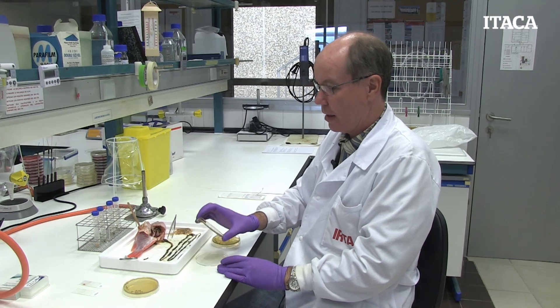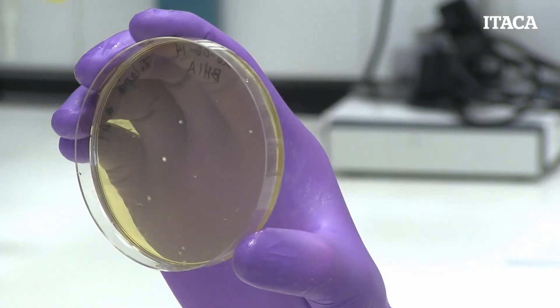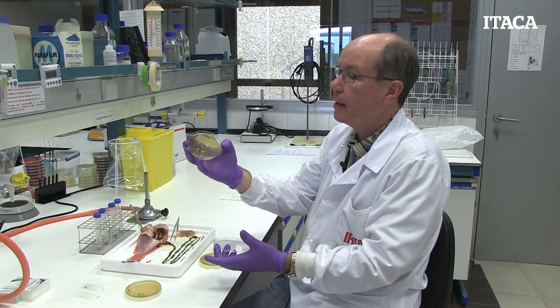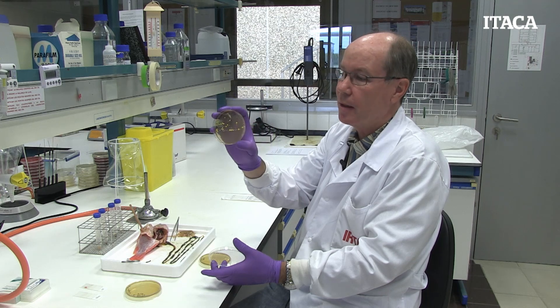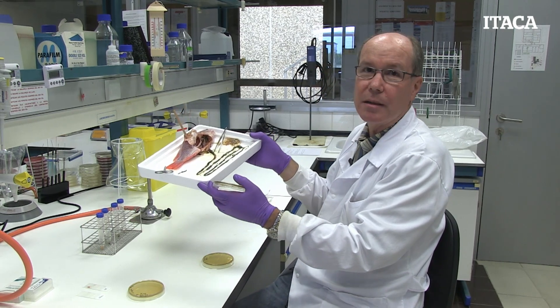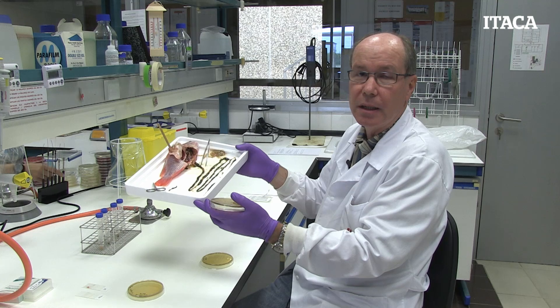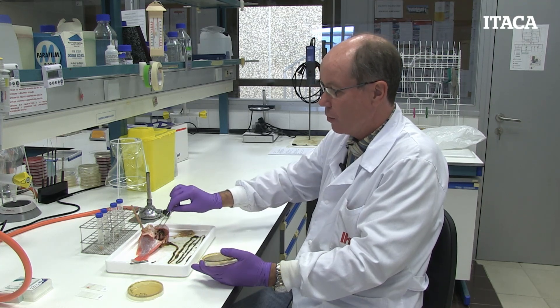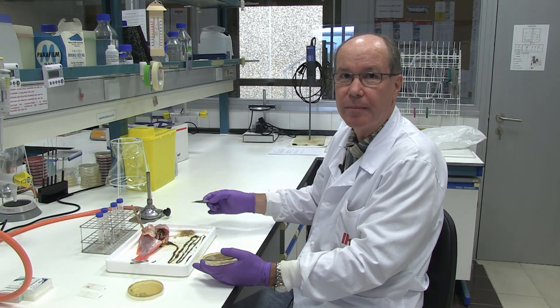After incubating the agar plates for 24 hours, we see a little bit of growth on this plate, but the animal is healthy — that's probably just mild contamination from the air. On another fish that was sampled, the gut was nicked and some of the bacteria from the intestine leaked out, and you can see quite a lot of bacteria contaminated the internal portion of the animal. This is not really anything serious — just contamination from the gut. As you can see, with such a large intestine it's quite difficult to remove it completely intact when sampling the kidney without getting a little leakage. So just to be on the safe side, it's good to keep things as clean as possible, and you can rinse out the body cavity with a little bit of alcohol just prior to cutting through the swim bladder and going into the kidney to sterilize it a bit further.